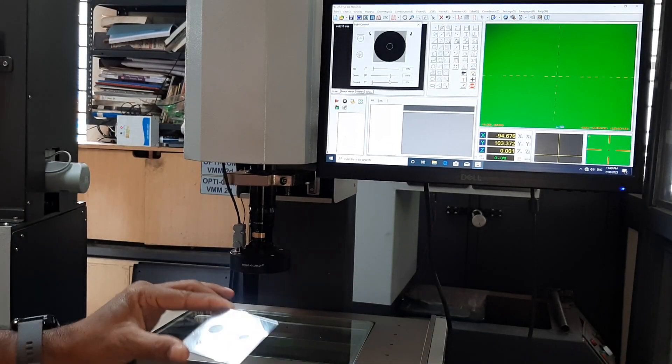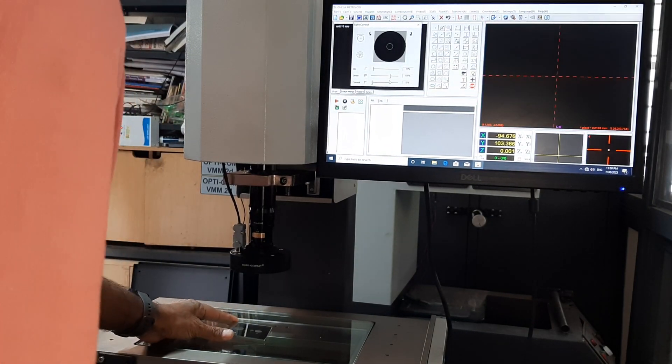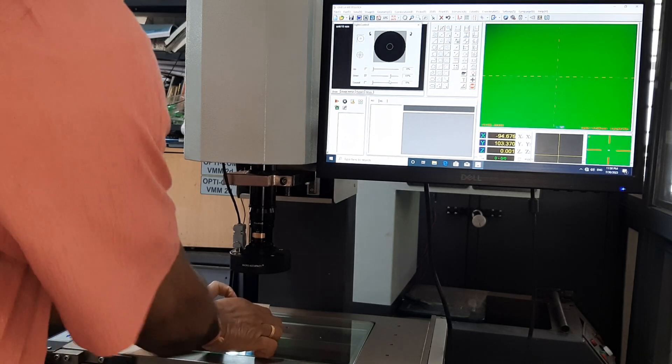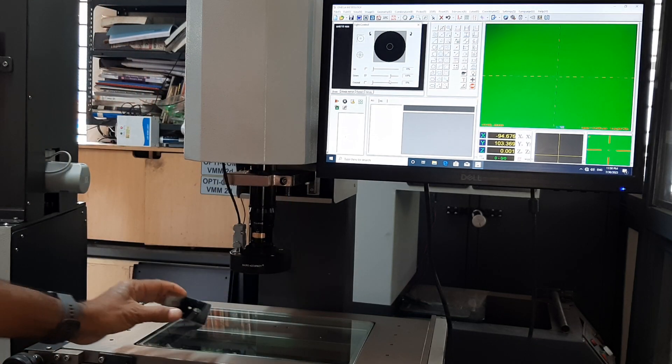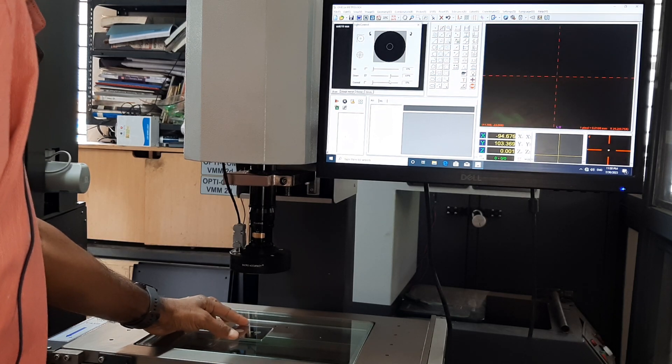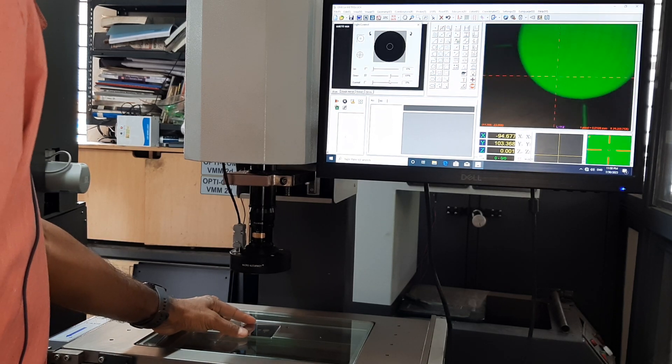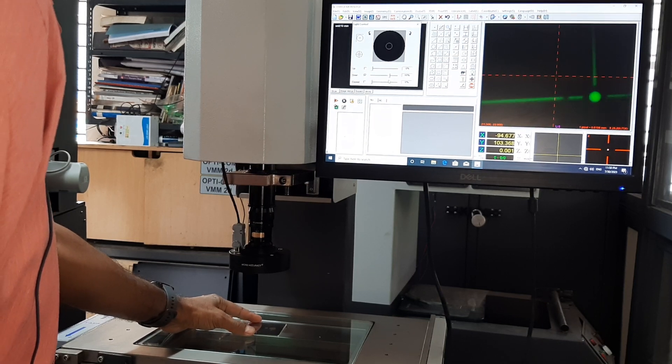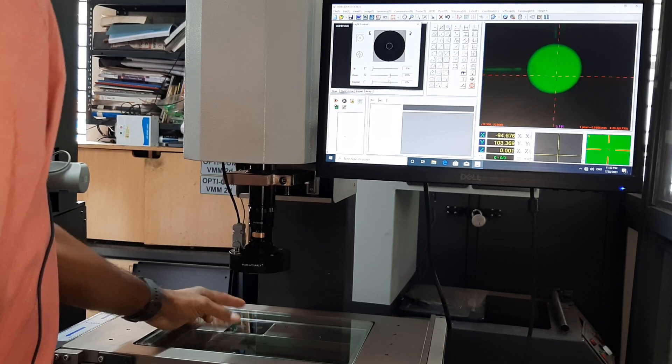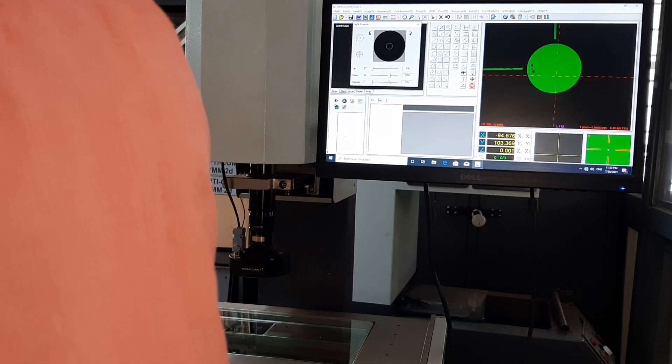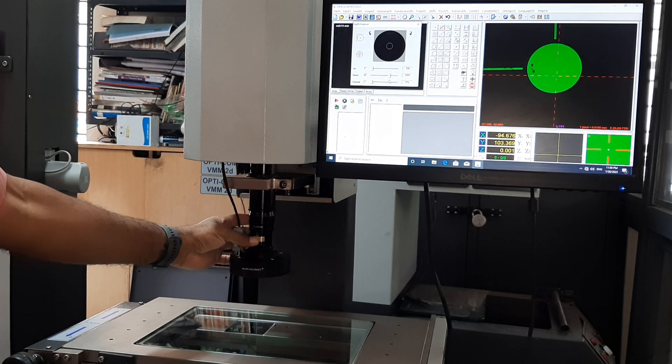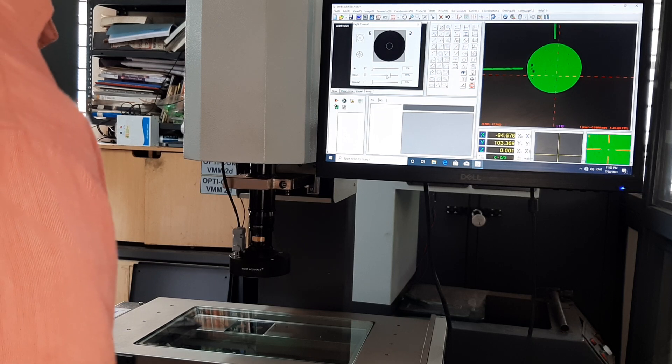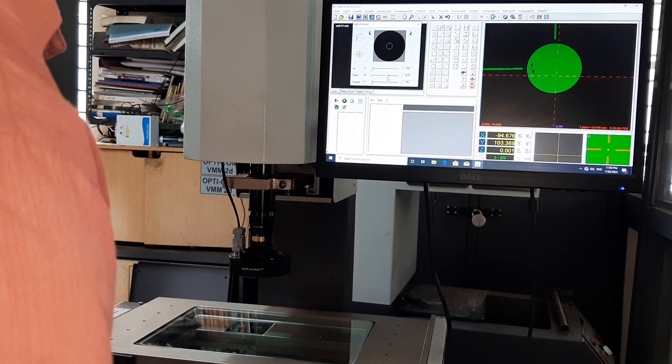Calibration of magnification setting. We have a calibration template, place it. Select magnification 0.7. Adjust the light level.